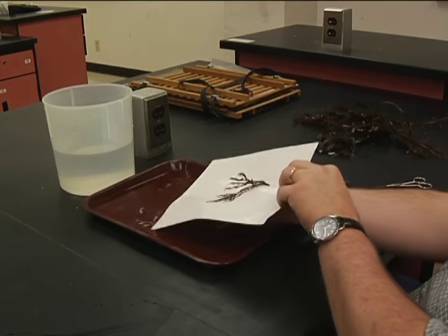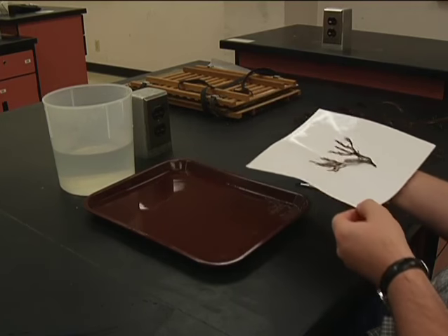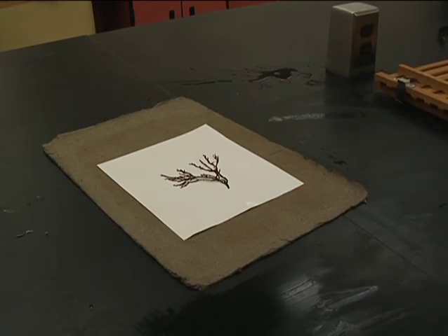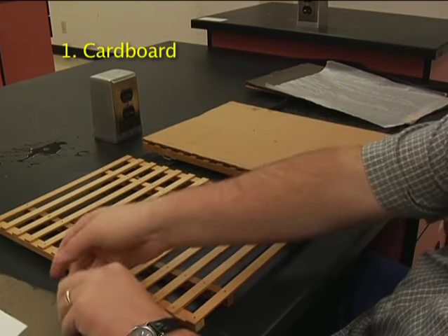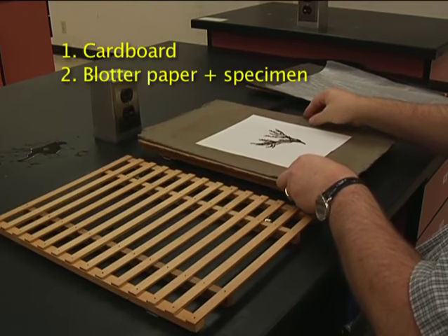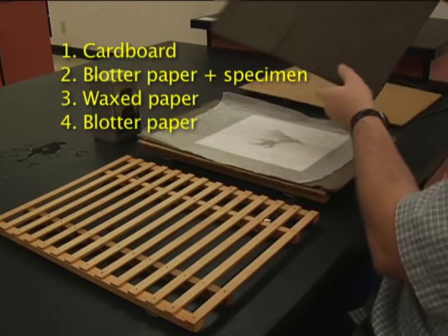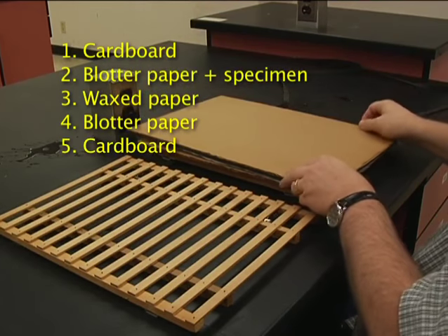Lift the paper from the pan at a shallow angle to keep the algae in place. Place it on a sheet of blotter paper or clean newspaper. Assemble the plant press in the following sequence: lay a sheet of cardboard on the inside face of a frame, lay the blotter paper and mounted specimen, cover with wax paper and another sheet of blotter paper, and finish with another sheet of cardboard.